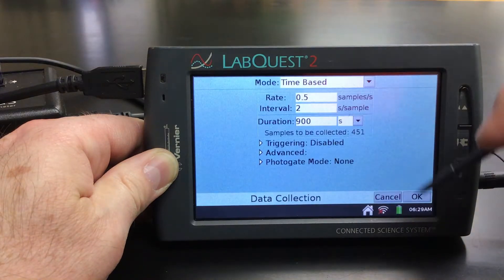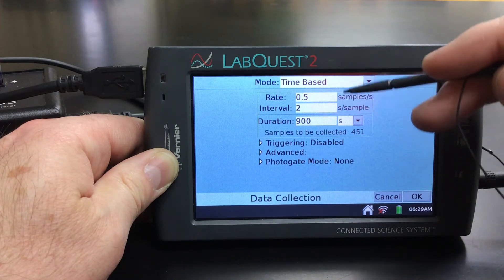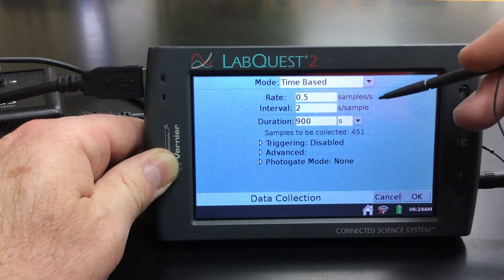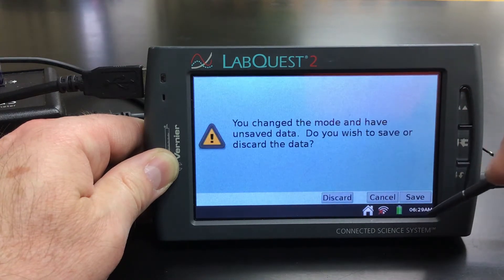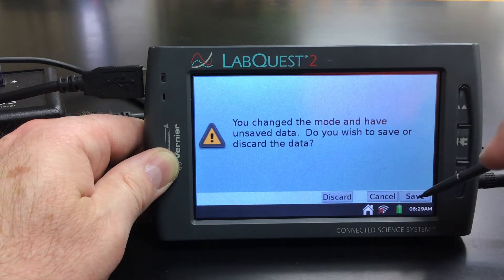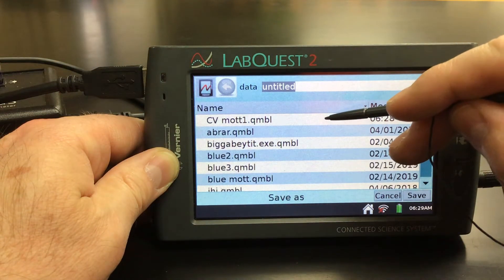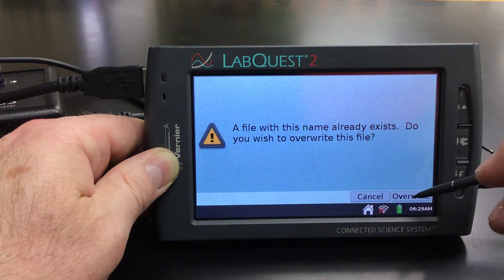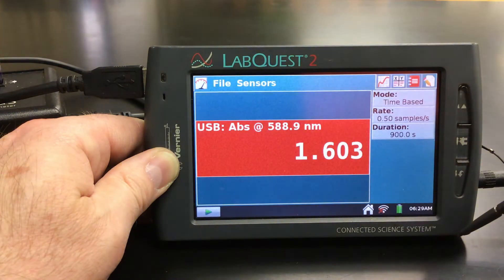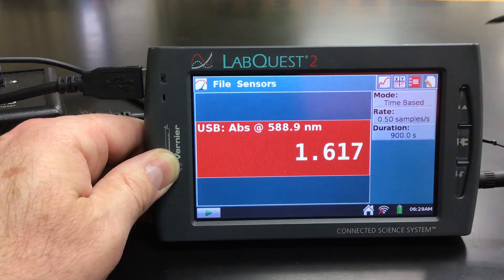I find it best to keep everything in seconds, otherwise the interval and how often it collects can get weird. So I'm going to hit OK. And we're going to hit Save, so hopefully it saves the wavelength we collected at. We're going to overwrite that. And yep, we're right around 590, which is what we wanted.